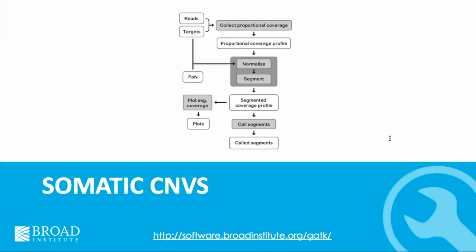So when do we get joint calling of somatic samples? Like when will it be developed? I have heard some chatter that there is a project to figure out how to do joint calling in somatic samples, but that is not something we currently do.